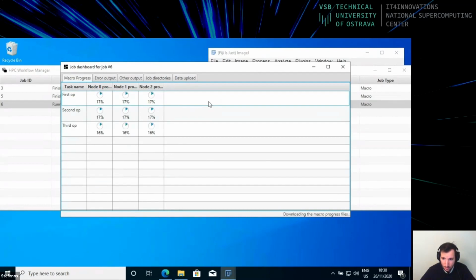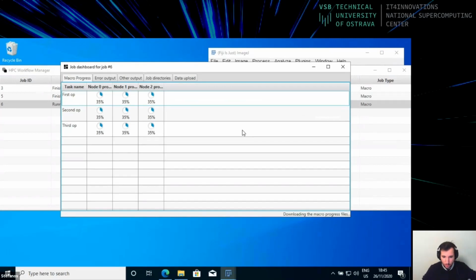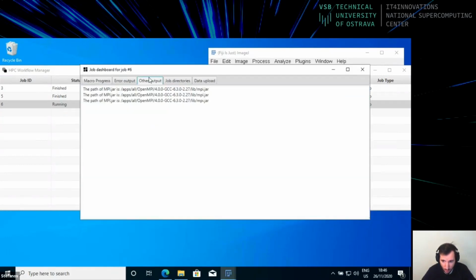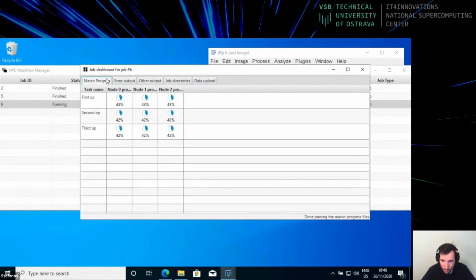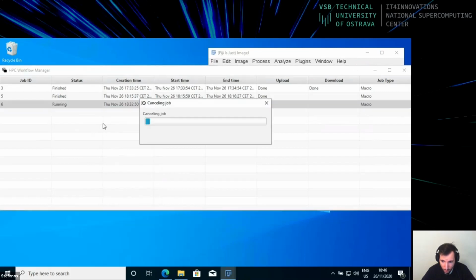So once you have seen this and it is working, unless there is an issue like we saw in the previous section, you can close this window once you see that this is working. You can close this window, okay? And since this will take half an hour, we can right click and click the cancel menu item. So just when you've seen this effect, close the window and right click on that specific job and cancel this job.